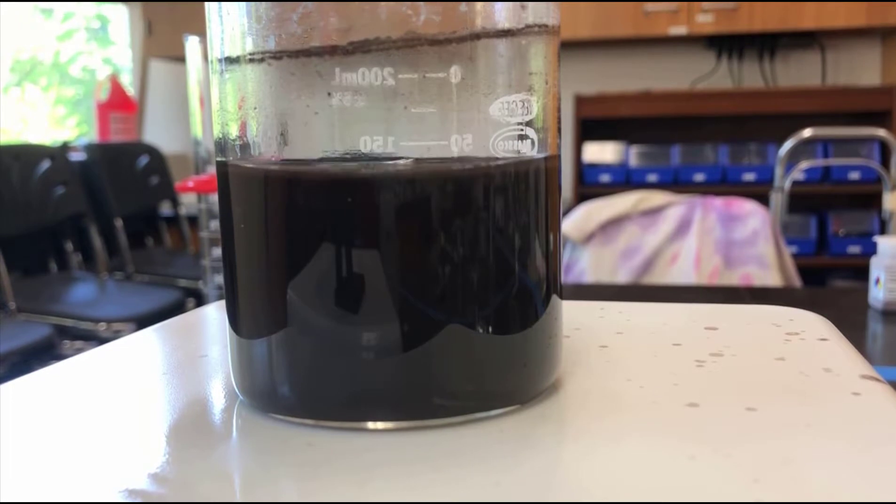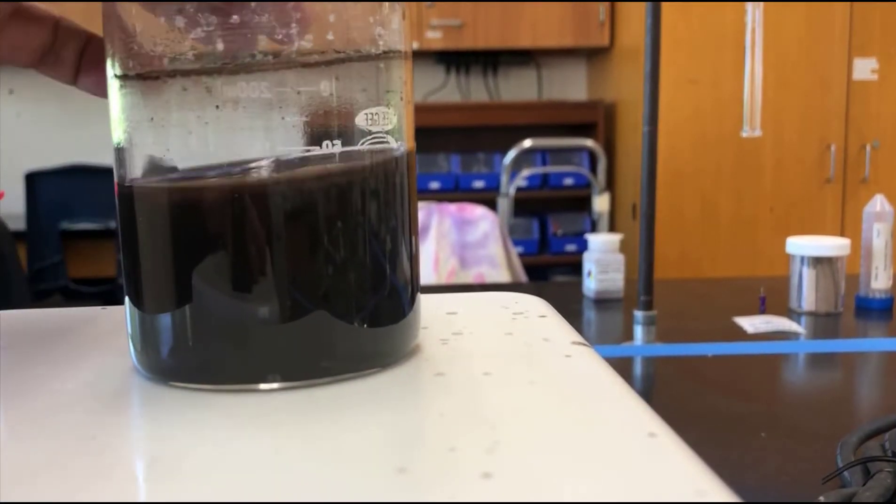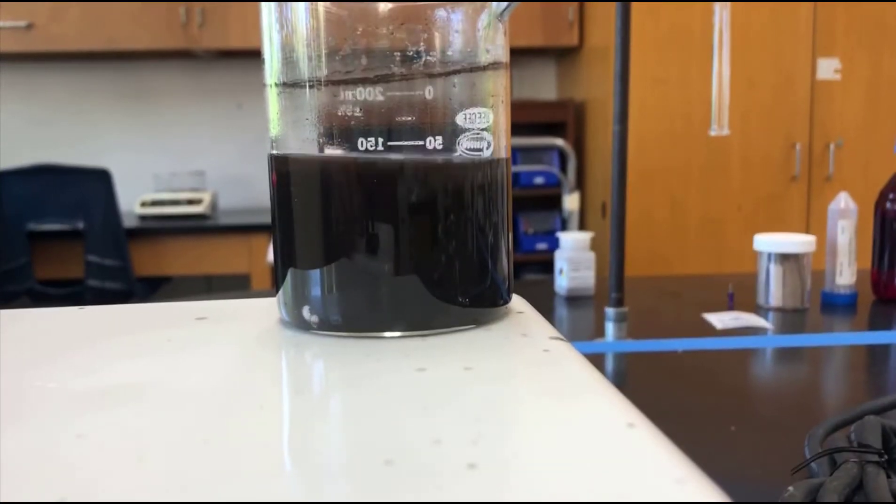If I don't stir it, it will do what's called bump. I want to let it cool slowly. A trick you can do if you think the hot plate is too hot: you can just move it off to the corner, because it turns out the corner of the hot plate is a lot cooler than the middle.